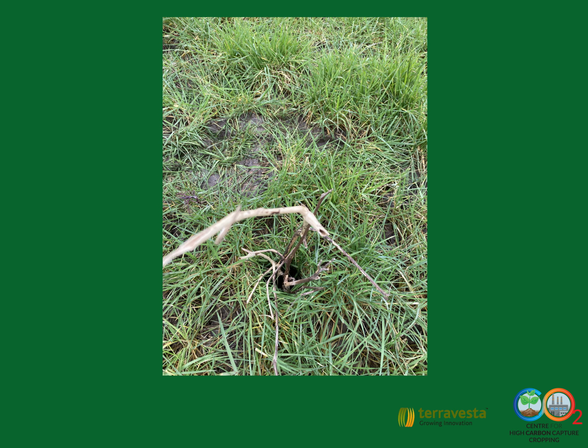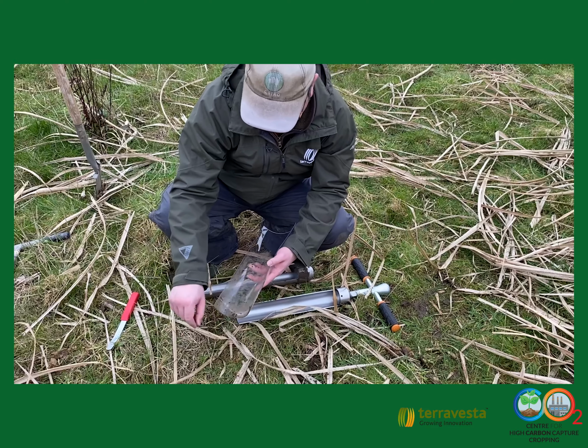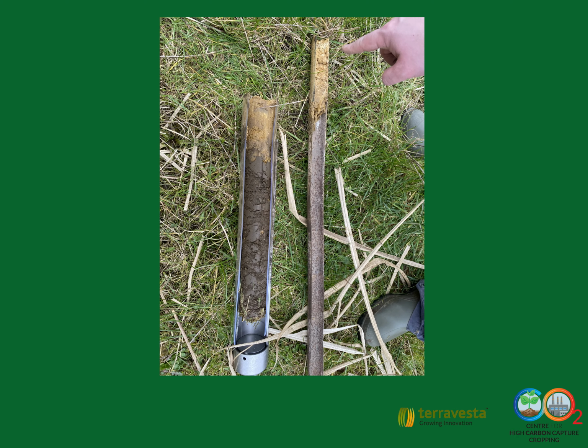To note, it can be helpful to mark out the holes with sticks to easily find them for taking the 30 to 60 cm samples afterwards. Once both cores are in the bucket, thoroughly mix the cores using the spatula to break up the soil, then using the bulk sample, half fill the labelled sample bags ready for sending to Yara or Landcrop. Finally, clean the equipment and repeat for the 2 30 to 60 cm samples in that parcel using the same holes, but this time using a 1 metre long auger to access the deeper samples.